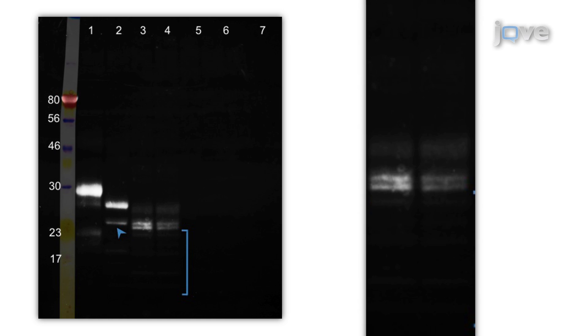The additional glycosidases used in lane 4 remove a few extra sugar residues. The protein migration is the same, but a slight reduction in intensity in staining can be seen.